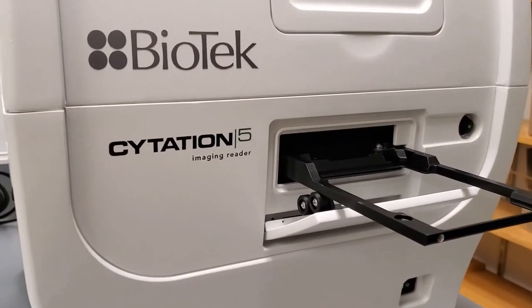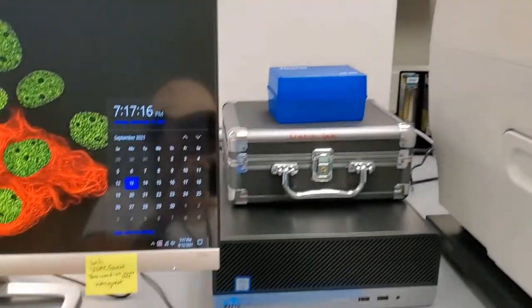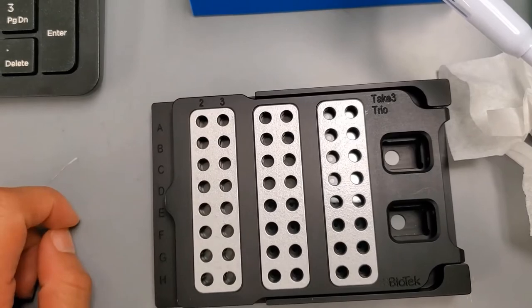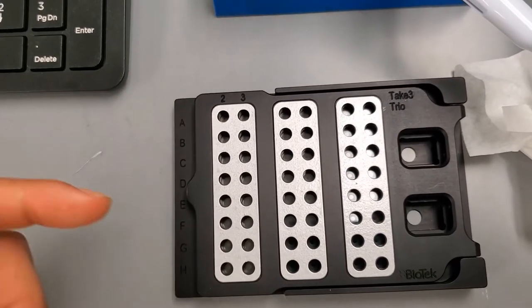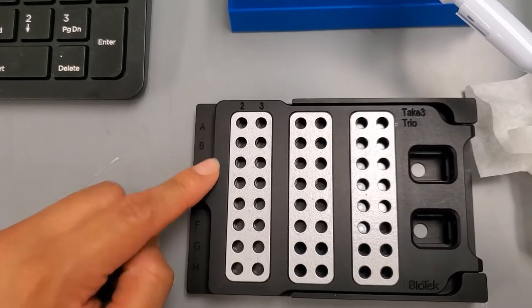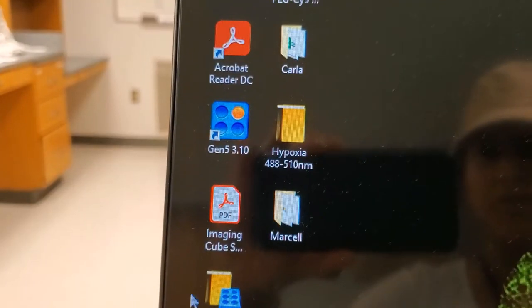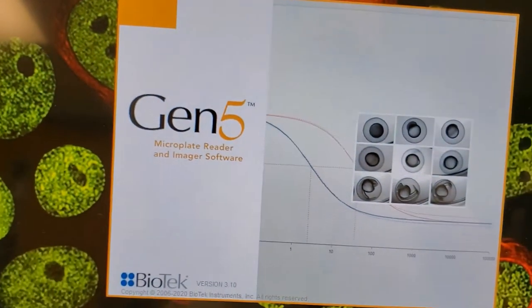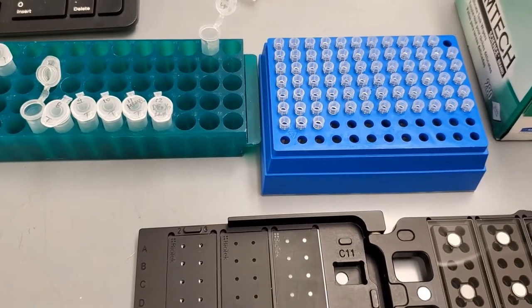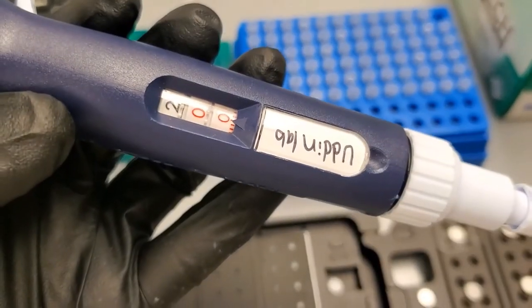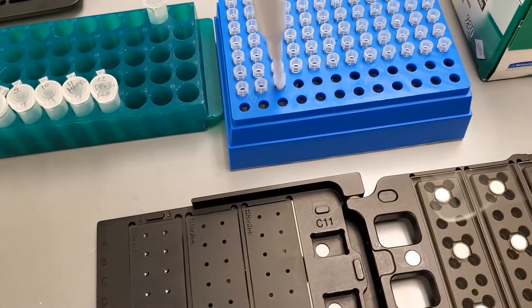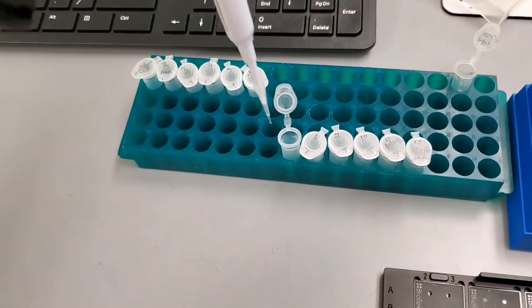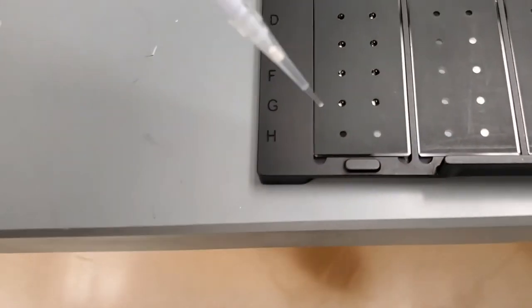For measuring RNA concentration, we use the BioTek Citation 5. Our machine has the Take3 Trio — you load samples in duplicate, with enough space for 24 different samples. The first two wells are for the blank, and there's space for 23 more samples. We use Gen5 3.10 software to read the RNA samples. I pipette two microliters per well and load onto the plate.